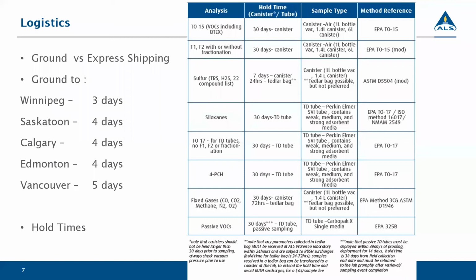Keep in mind that when you do duplicate sample, say you ask us for a 8-hour, or let's say it's a 12-hour flow controller, time weighted average flow controller. So that's the one with the diaphragm on it. Note that it will take 12 hours to fill one can and 12 hours to fill the other, because that's the flow rate that we set it for. So it's there to collect that 1 6-liter can in 12 hours. So if you've got 2 connected, it'll take 24.